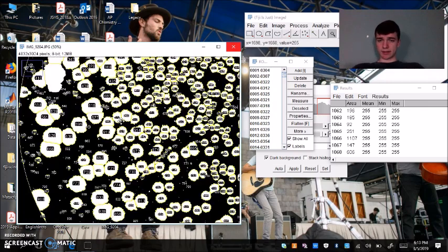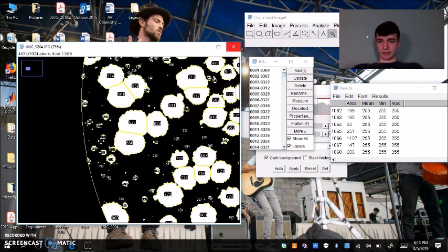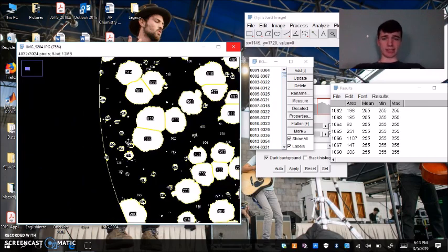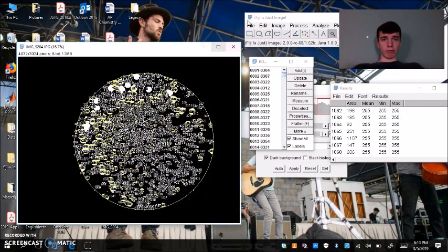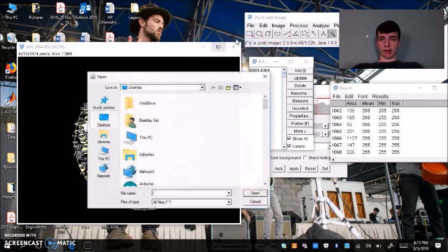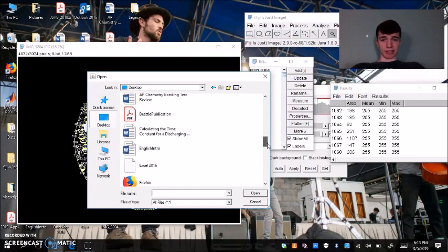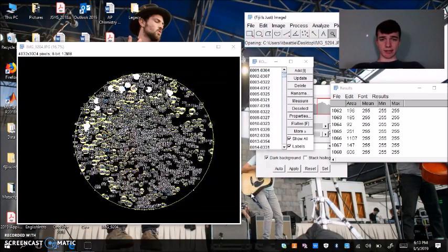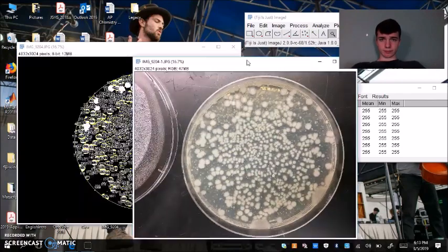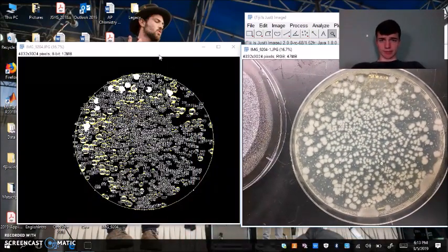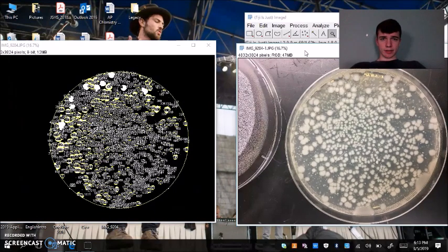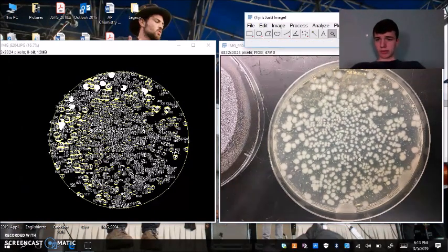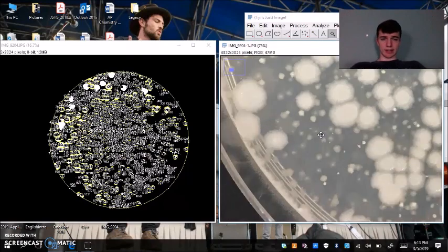Again, we're going to zoom in. We're going to see if you like how the analysis was done. What we can also do, file open, is open up the original image and put them side by side. Compare them. Again, use my magnifying glass tool. Zoom in here.